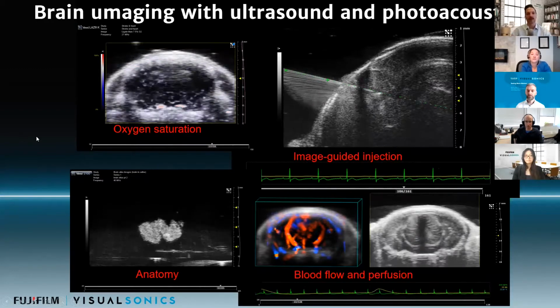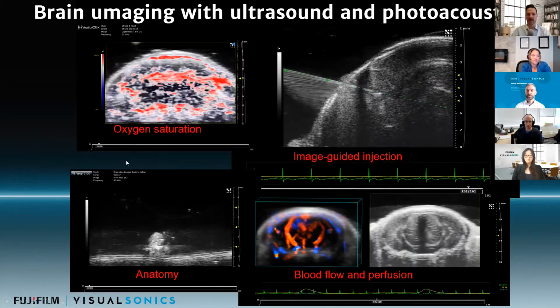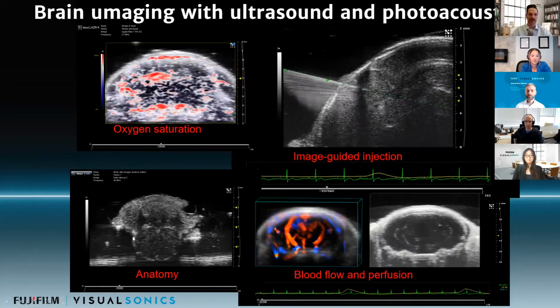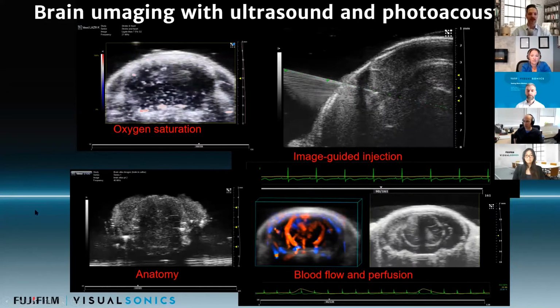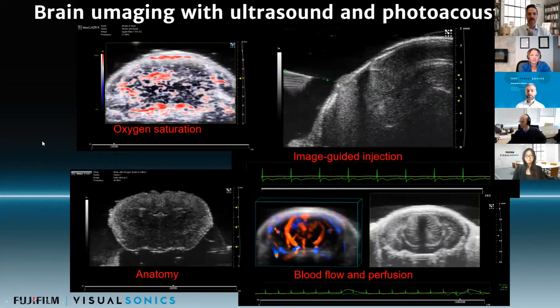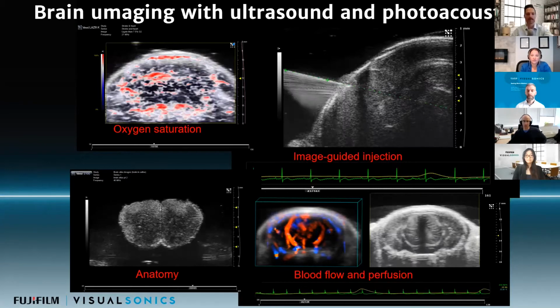We say, oh, ultrasound can be tricky through the brain. When you're looking at a mouse skull, which is already pretty thin, and looking at some of these tools here, yes, in some cases it's quite ideal situations, especially when you scoop the brain out. But the advantages of having that resolution, having that real-time aspect, I really think this is again ripe for publications looking into this using these tools.